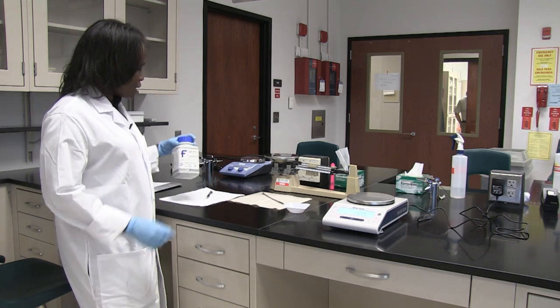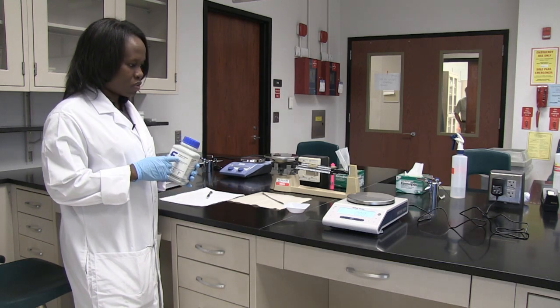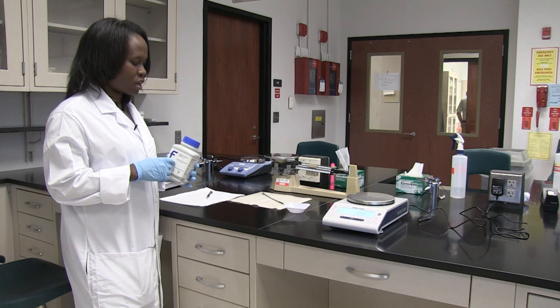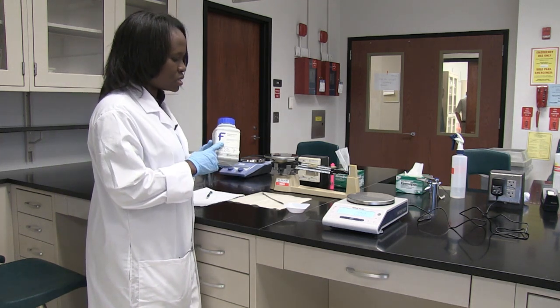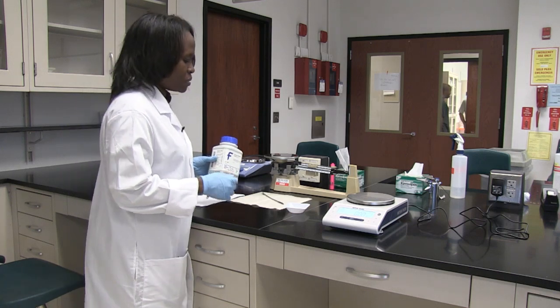Now I'm going to show you how to measure the weight of a solid. In this case, I'm going to measure one gram of potassium chloride. So I want to make sure that I measure out from this container one gram of potassium chloride.